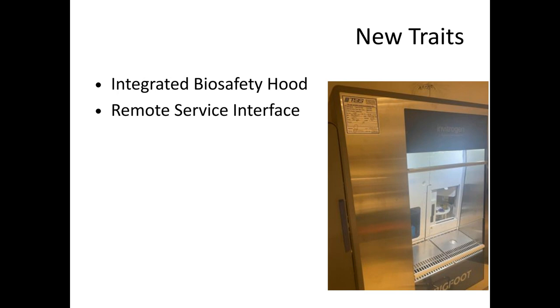They have this whole super complex user back panel that allows them to diagnose the machine remotely. And a lot of times they can fix it without ever even coming in, or if they do come in, they already know what's not working and the part's coming in with them. And so with that, I think that has to be a trait that is a part of all future instrumentation, because the amount of time we've lost waiting for service, just as a function of reducing, making air quotes, optimized manpower and service, is a burden on the researchers.